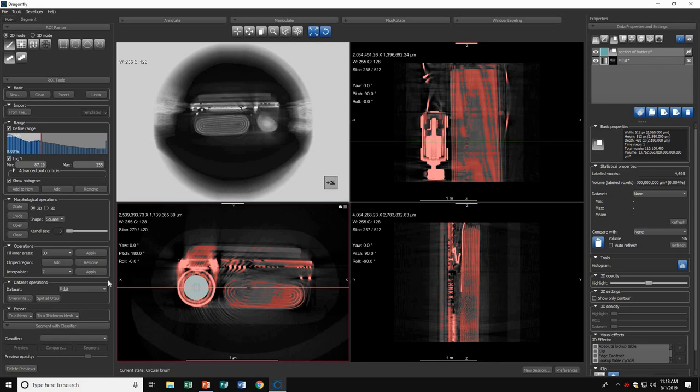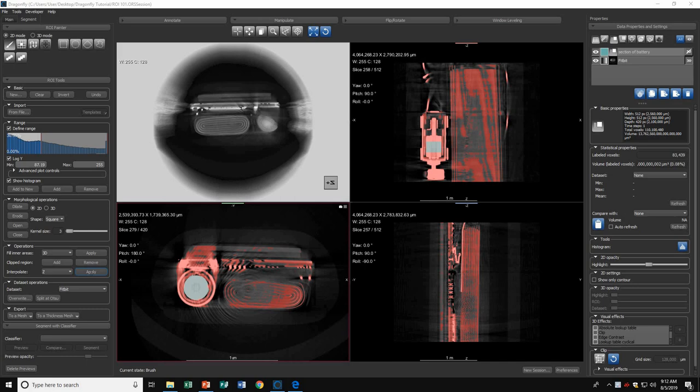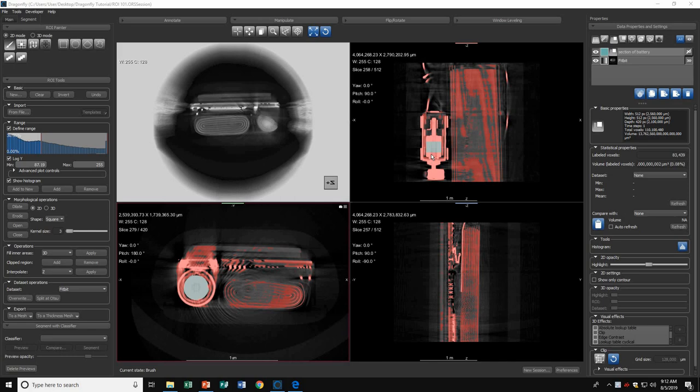Now that I've hit Apply, you can see Dragonfly has interpolated all the data between the two slices I painted in the beginning. This is helpful so you don't have to paint every single slice yourself. Instead, Dragonfly can just interpolate it for you.